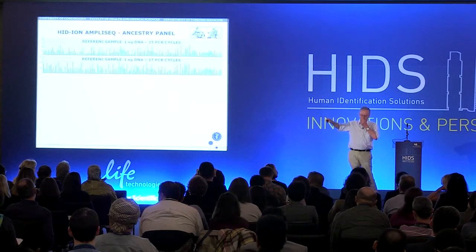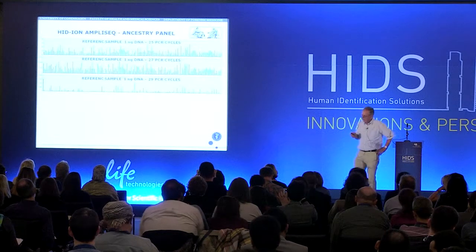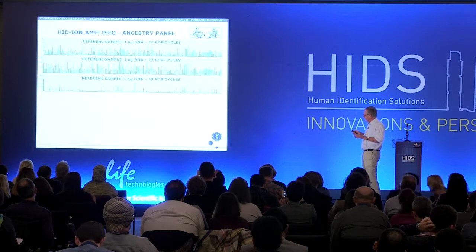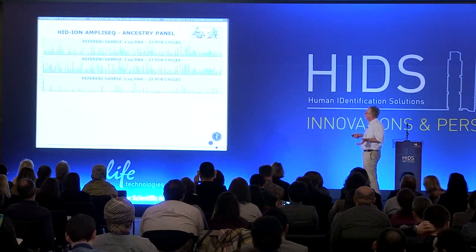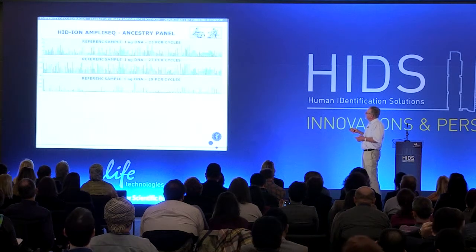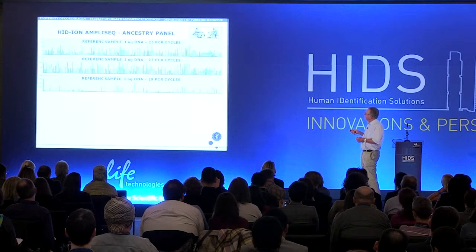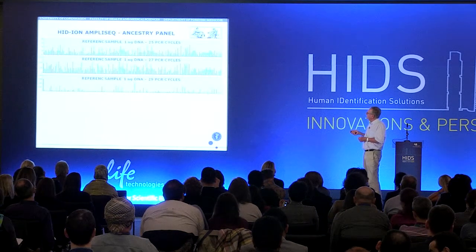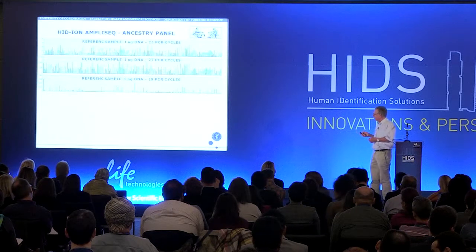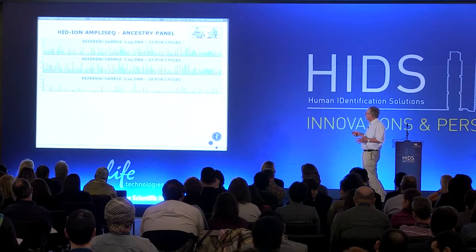And here we see some results where we have modified some of the PCR cycles because we wanted to increase the sensitivity of the whole system. I think that the original recommendation was maybe 17 or 19 PCR cycles, and now we have found that around 25, 27 PCR cycles can optimize the system, but that is the maximum.